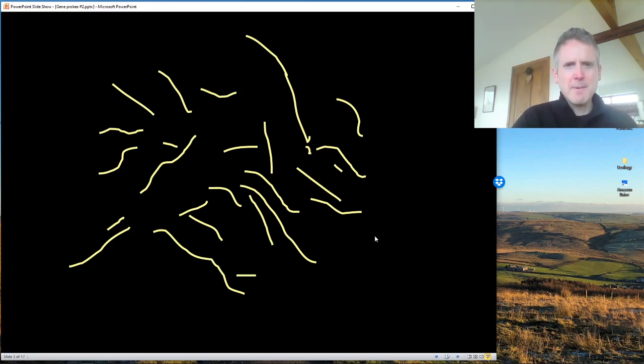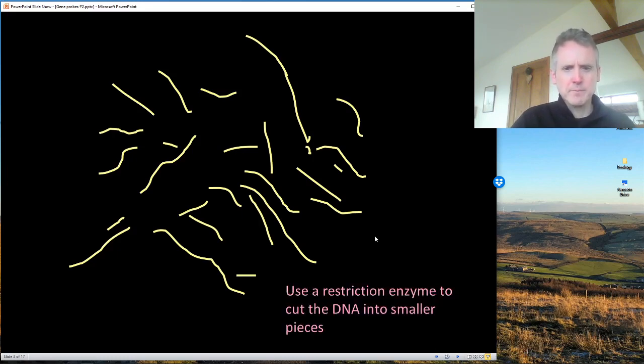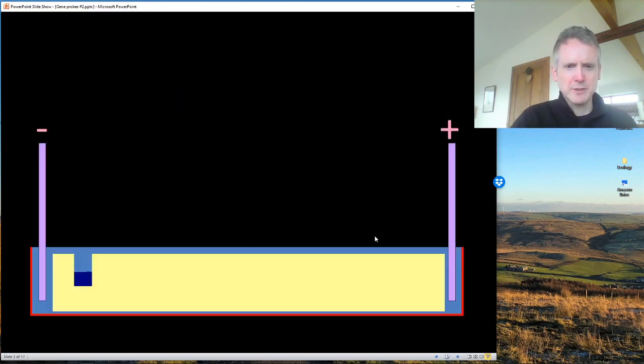The aim now is to organize these pieces of DNA into order of sizes so that I can get what's called a gene probe to the DNA to find this potentially defective allele. So we use a restriction enzyme to cut the DNA into small pieces, and then we will load it into this machine. I'm going to go through this in bits, and there's a file that you can download that you can fill in as we go, or you can take it all in and make a summary for yourselves.